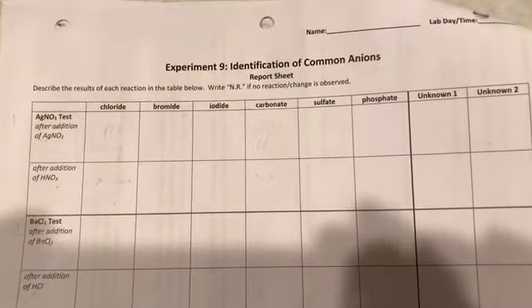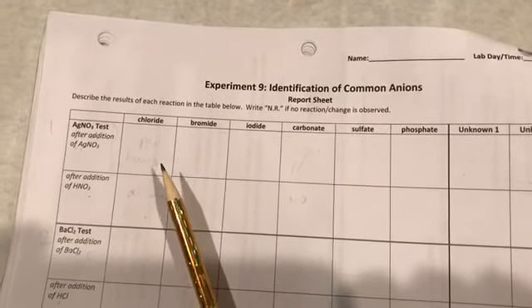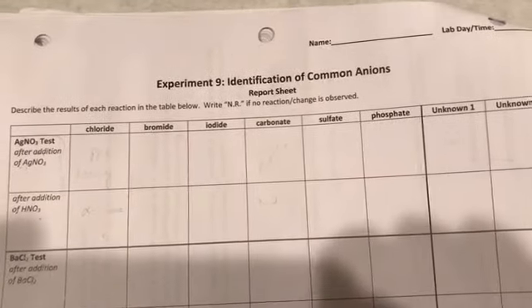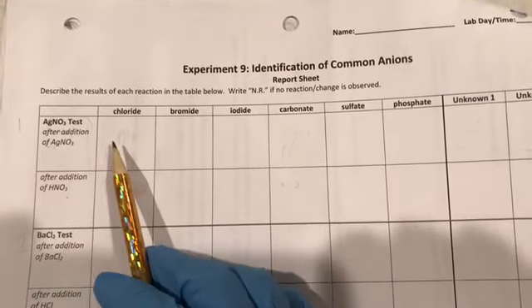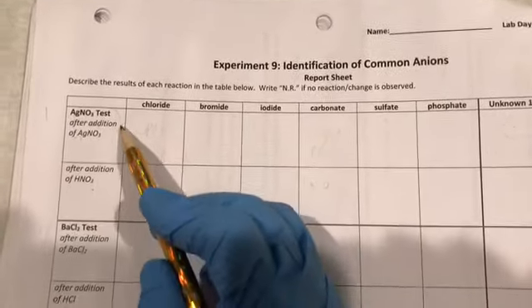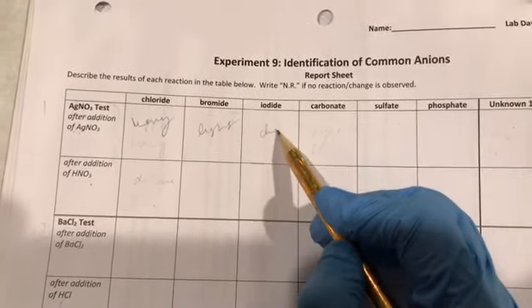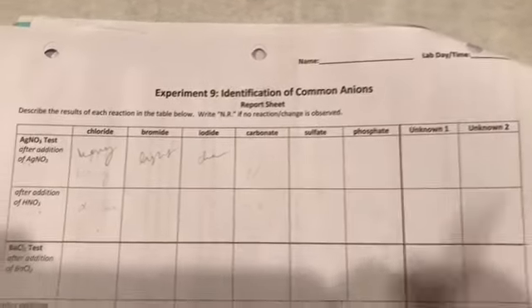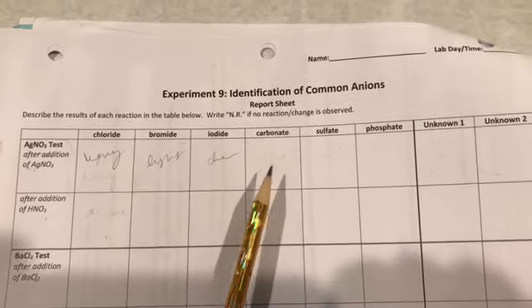So you are going to record the observations for all the 8 test tubes in the first row when you just added silver nitrate into the test tubes. And while recording the observations, you have to be very careful whether it is a heavy precipitate, for example, let's say here the heavy precipitate. Let's say here you see the light precipitate or clear, something like that. So you have to be very careful when you record the observations here. These are just samples. I'm not sure whether these are the actual observations, so you have to see the recording carefully to record the observations.